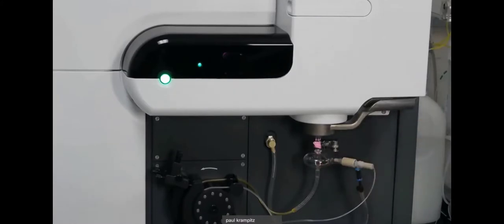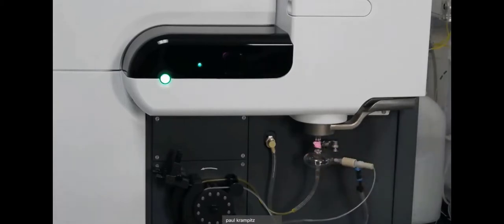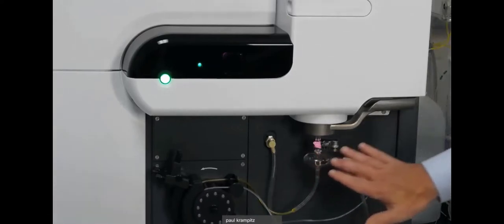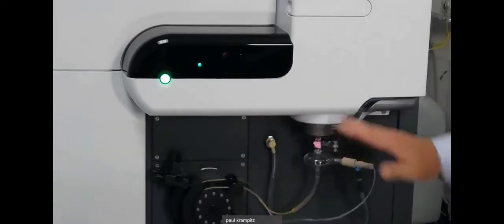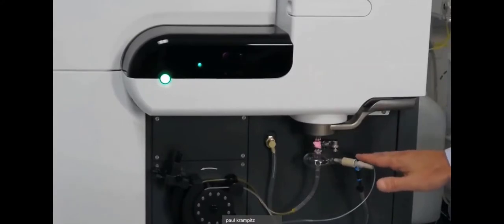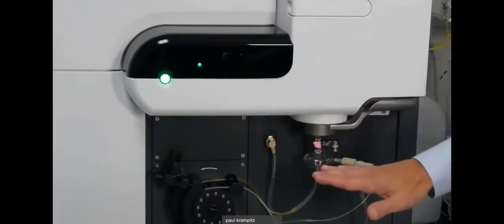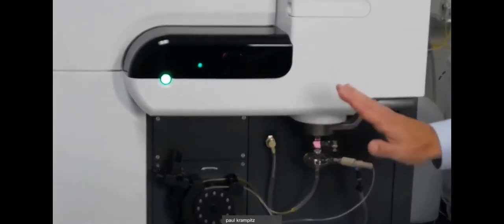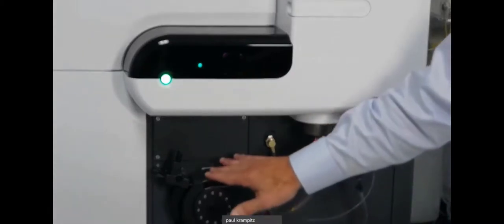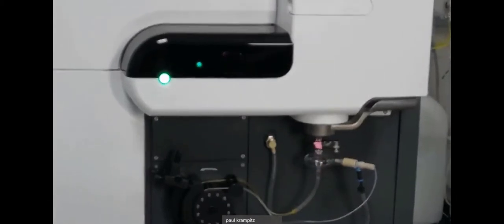That's to separate the small from the large droplets. And you can see the reflection of the plasma here in the spray chamber. It has more of a red emission from the plasma rather than a bright white emission from argon. This is your maintenance area here, or what we call the kitchen. And it's very easy to take this apart and do any maintenance on the nebulizer and the spray chamber if you'd like. I'll show you how to take the torch in and out quickly as well. It's very easy. It only goes in one way. And this is your sample tubing and your drain tubing. So that's a very quick overview of what the instrument itself looks like.